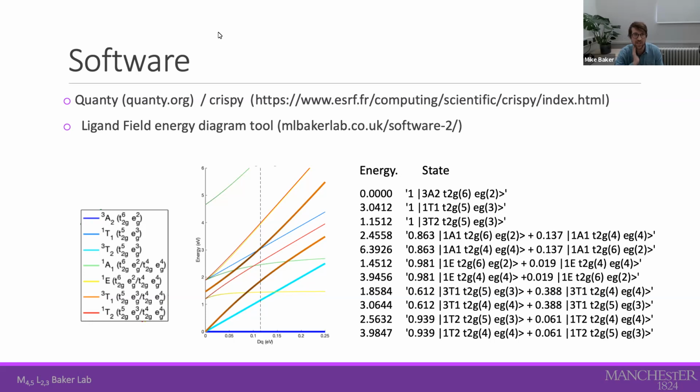This then reduces that dd interaction, and you can consider that beta value decreasing further, somewhat below 0.8, so a scaling of 0.6 or something like that could be feasible. So there's quite a restricted range which the value can take.